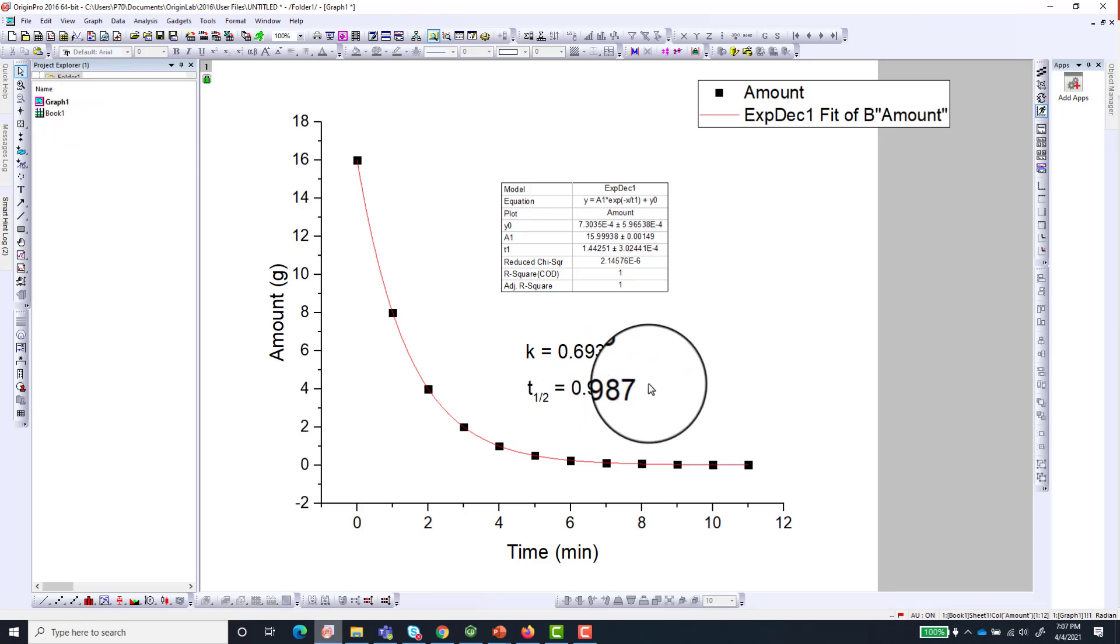Alright, so this is how to fit your data to exponential decay and how to extract the fit's parameters.